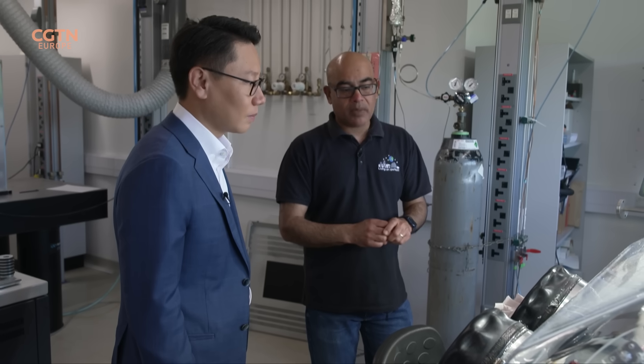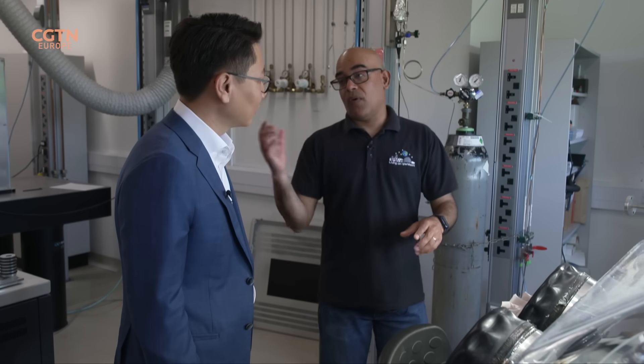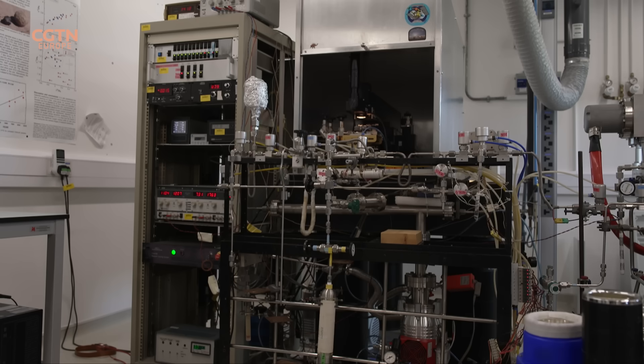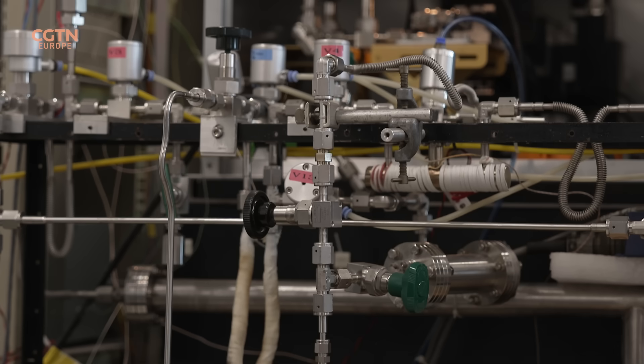We will actually take a small amount of sample, weigh it out, and take it over to our Oxygen Isotope machine, which is right next to us. So we can look through that. This machine is called the Laser Fluorination Oxygen Isotope Setup.